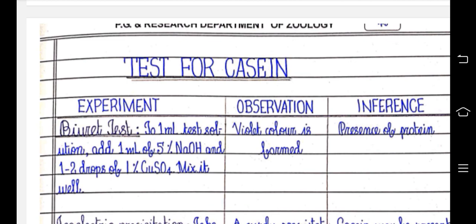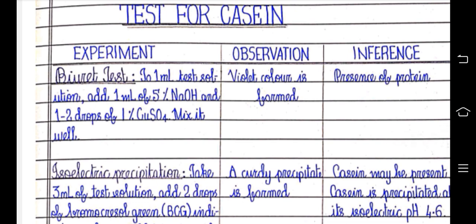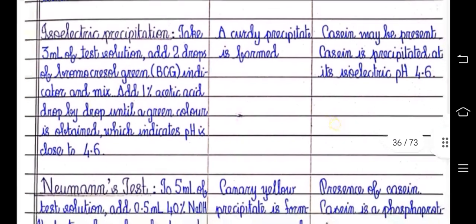Once again, let's have a quick recap about the test for casein. Biuret test is performed. It turned out to be positive. Then isoelectric precipitation. Take 3 ml of test solution, add 2 drops of bromocresol green or BCG indicator and mix. Add 1% acetic acid drop by drop until a green color is obtained, which indicates pH is close to 4.6. A curdy precipitate is formed. Casein may be present. Casein is precipitated at its isoelectric pH, which is 4.6.